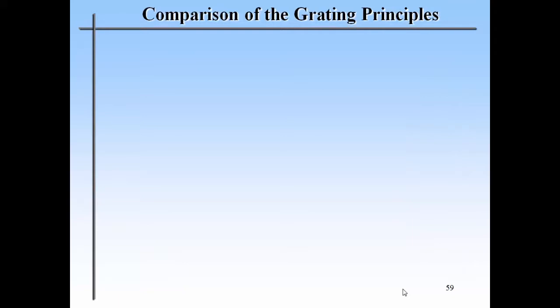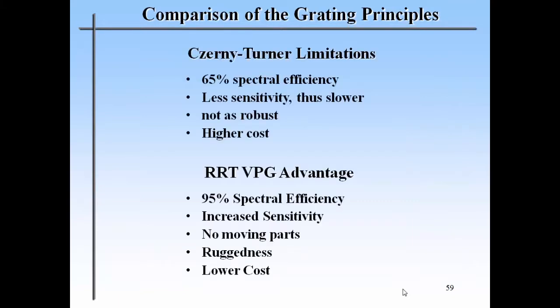According to Rigaku Raman Technologies, the advantages are higher spectral efficiency, increased sensitivity, ruggedness, and lower cost. I cannot see that the other is not as robust. I'm not absolutely sure, but I would be careful. But spectral efficiency, yes.